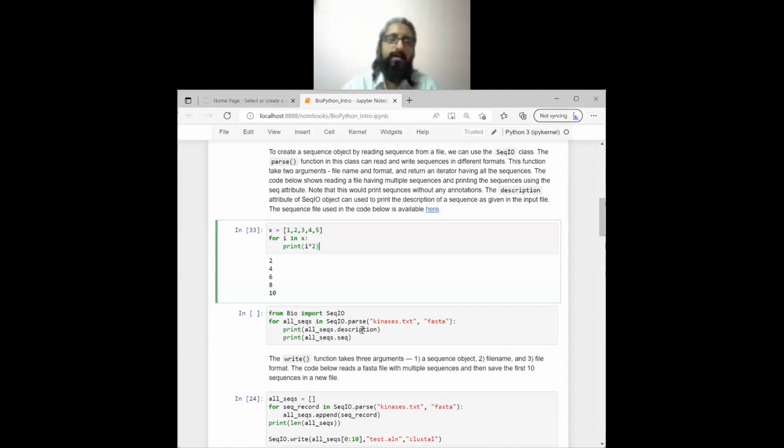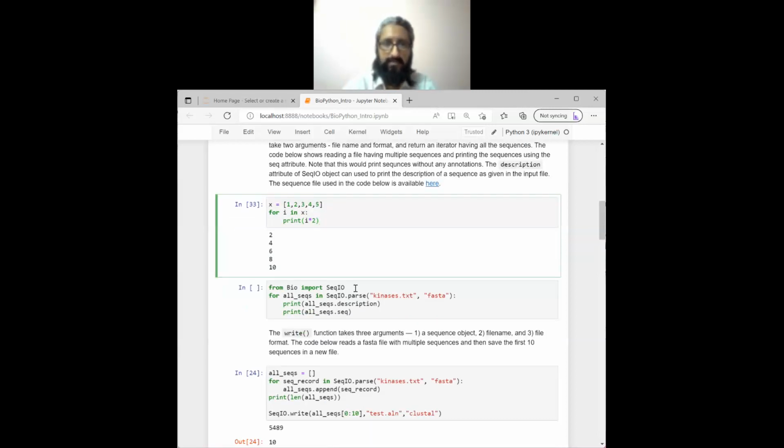Okay. So I have noted your question. I'll talk about it. There are a lot of concepts in dynamically assigning a name, and there are multiple ways to do that. You can either take user input or you can take some command line arguments. So we'll cover that. Let me just finish this box and then I'll go to that.